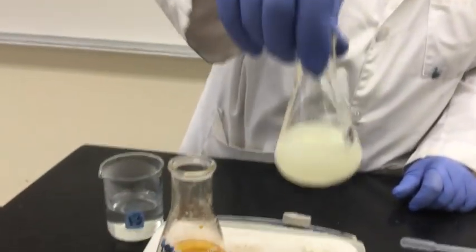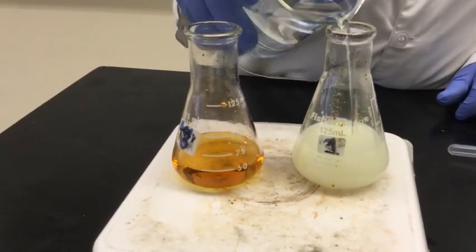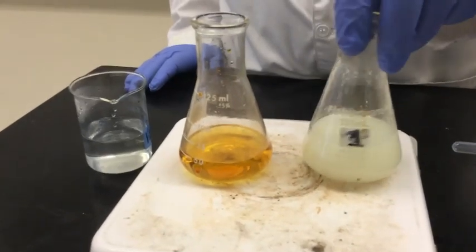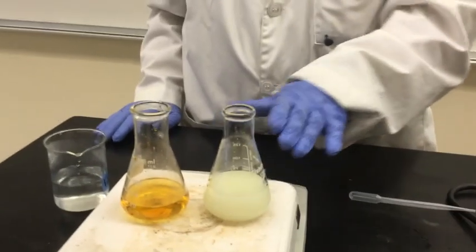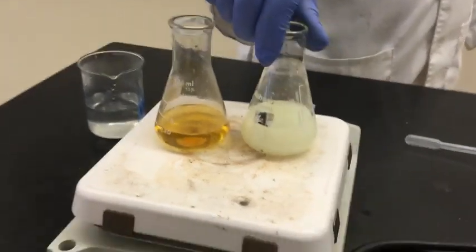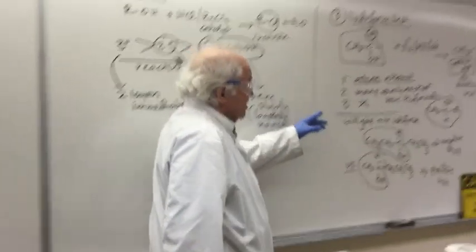Now over here, you see the solution becoming cloudy. In the long run, when you heat it up for a while, you can add a little bit of hot water here if you like. Okay, and what happens here is the solution stays intact here, but over here you get the precipitate, and if you centrifuge it, you will find out that this is actually a positive iodoform and it will yield the yellow precipitate. So again, this is our known and this is our unknown. This means our unknown now does not have this group, CH3CHOH.